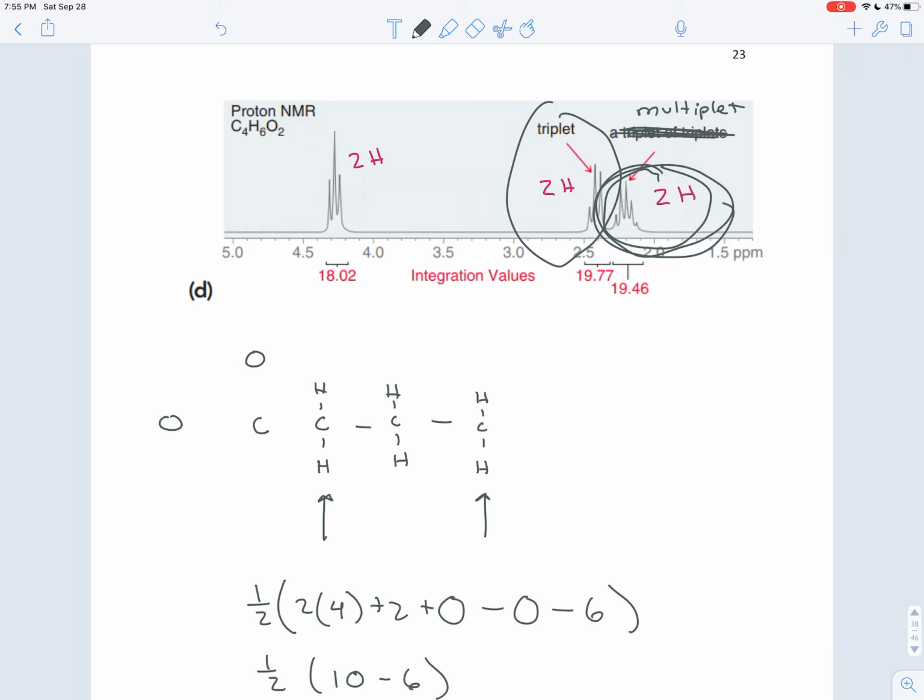Now, I put the oxygens on the left side of this molecule because this CH2, the one represented by that peak, is very shifted to the left. And remember, a CH2 normally shows up at around 1.2. But here, it's showing up way further between 4 and 4.5. And the only way it could do that is if it had oxygens nearby. Normally it's at 1.2.